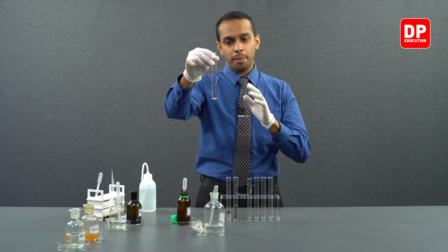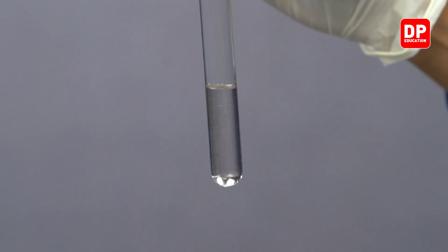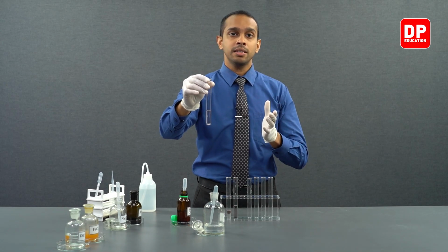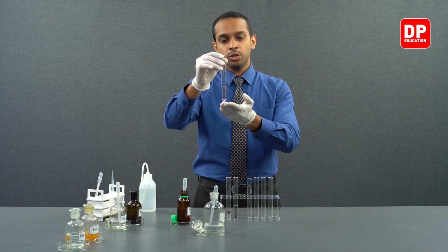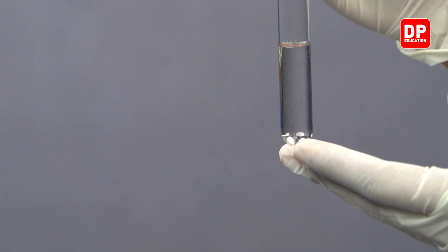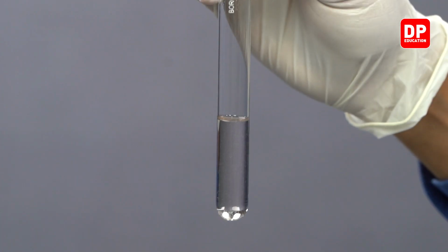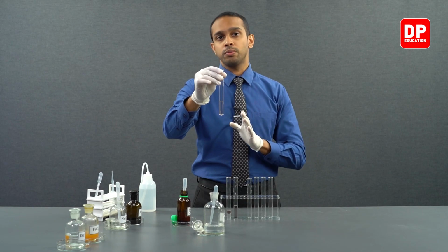This is again because of formation of phenoxide anion. Although phenol is only moderately soluble in water, phenoxide anion is soluble in water. Therefore, you will see the formation of a clear solution that has a slight pink hue to it. However, we will see the formation of a clear solution when sodium hydroxide is reacted with phenol.